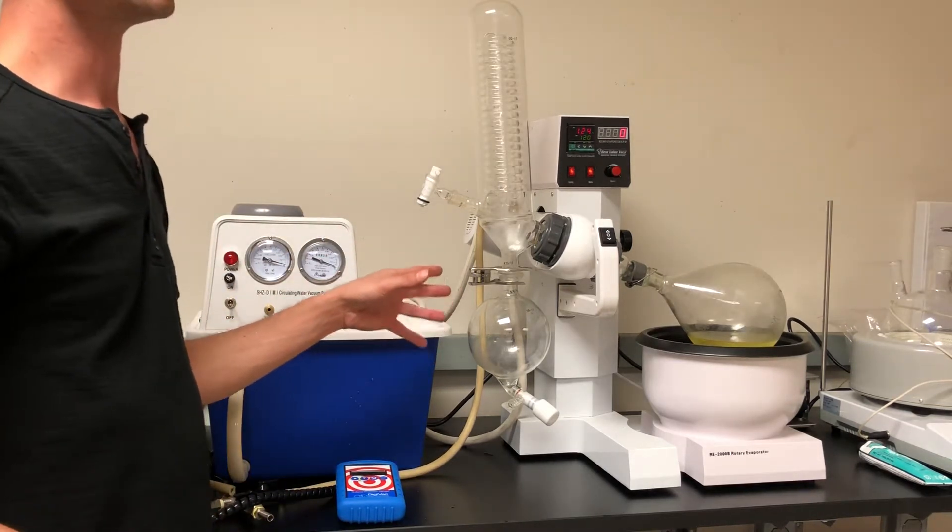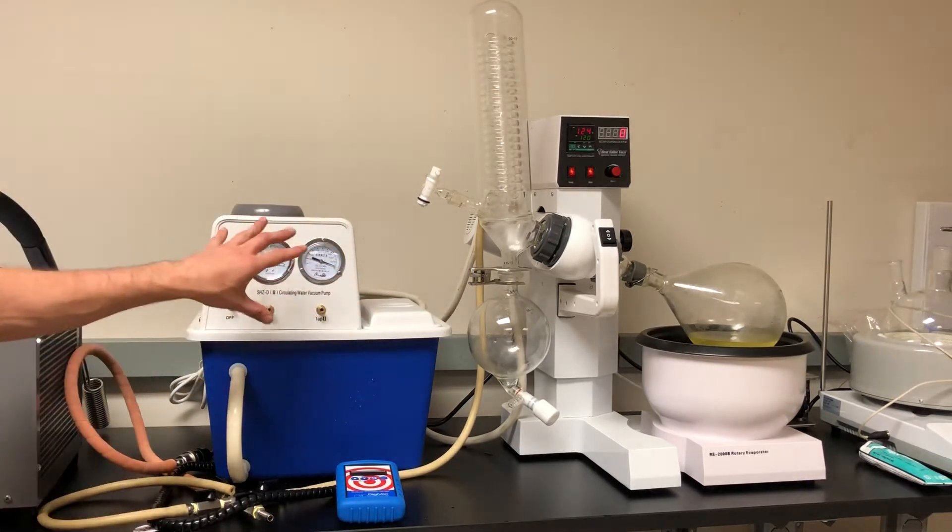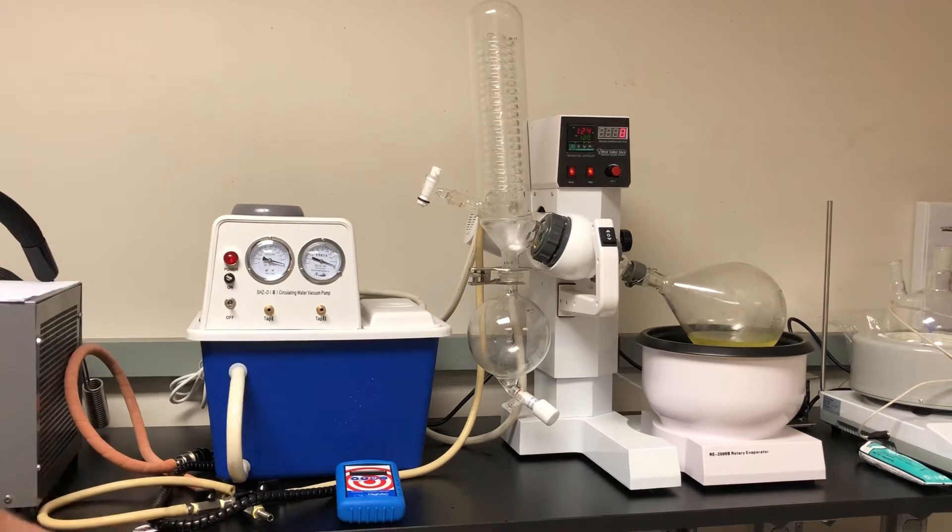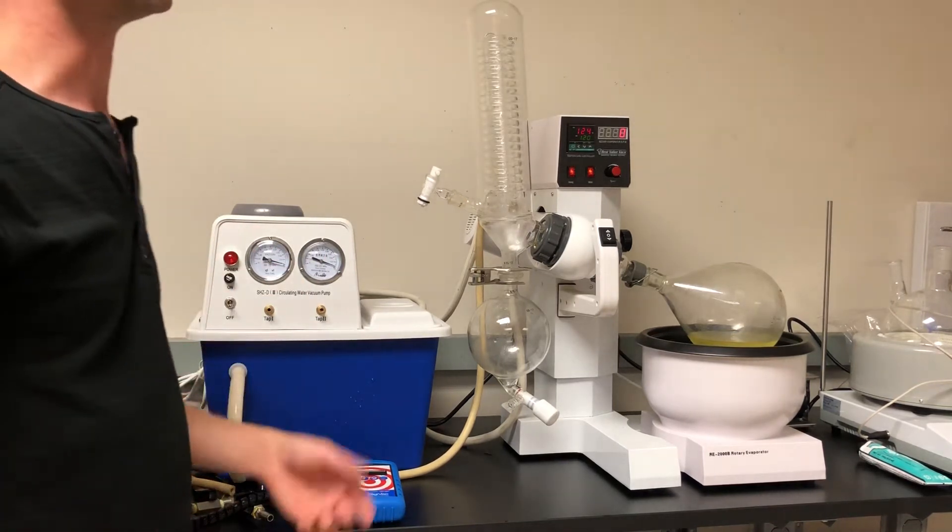The system next to me is the two liter roto evaporator. I would not recommend using this for anything larger than the two liter just because it doesn't have the capacity to do it.